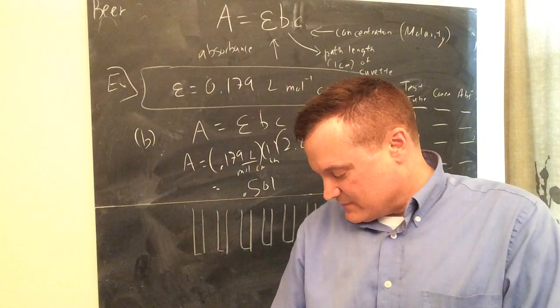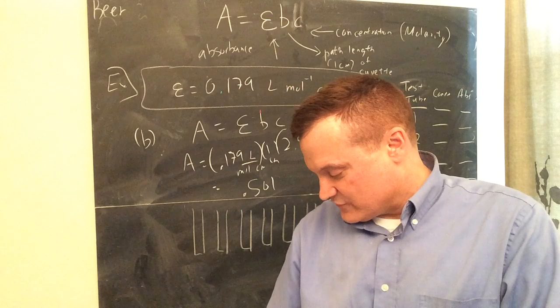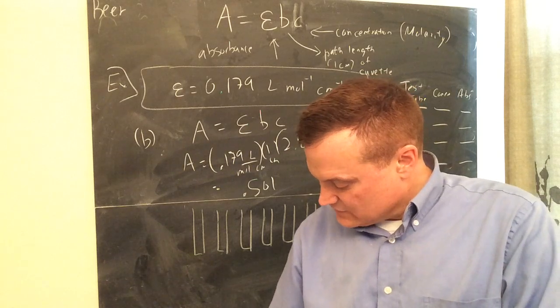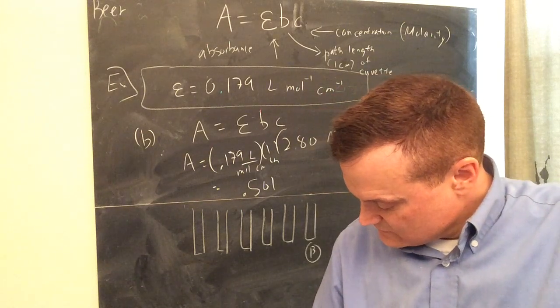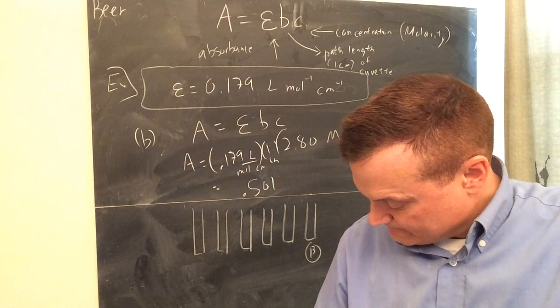Number 1, label test tubes 1 through 5. B for a blank. Measure 5 milliliters distilled water into the graduated cylinder. Pour it. Okay. Get 2 graduated cylinders. 1 milliliter of 0.10. Add distilled water to a total volume to make 0.10 molar solution.